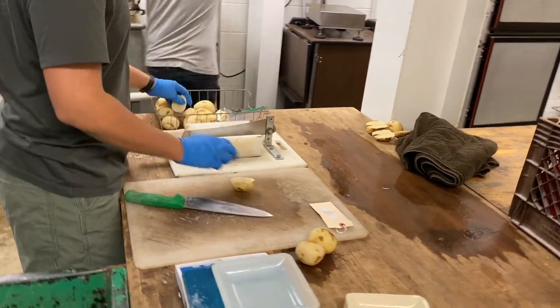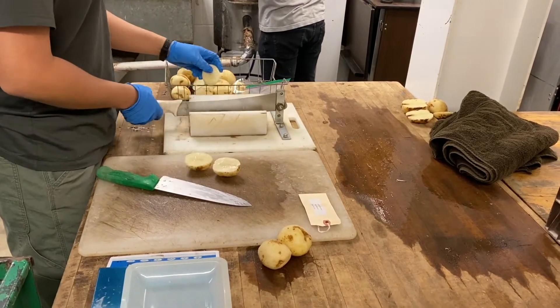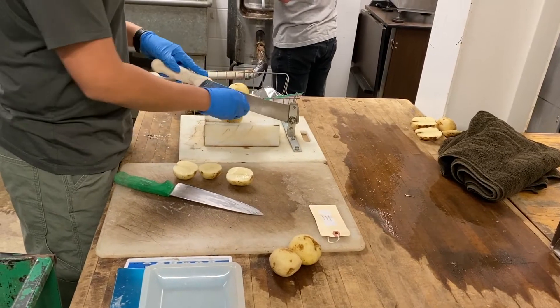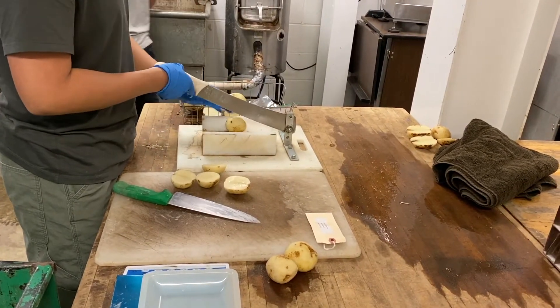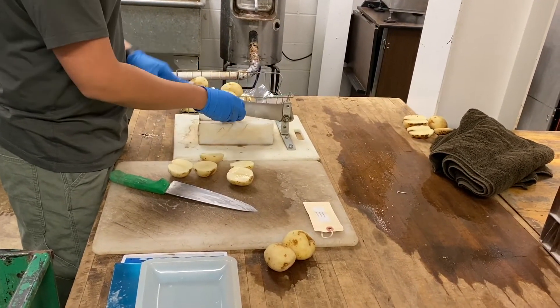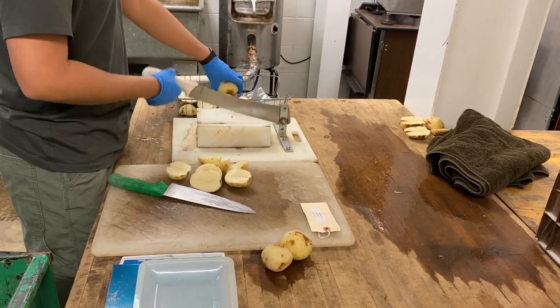After peeling, the next step is to cut the tubers into halves. One half will be further cut into pieces for sugar analysis — sugar meaning sucrose and glucose. And the other half, we are slicing that for potato chips.